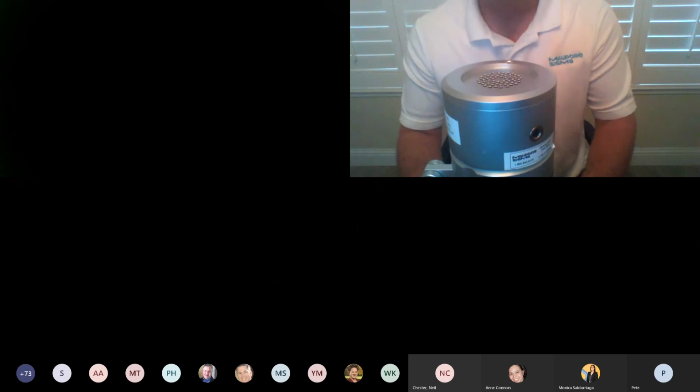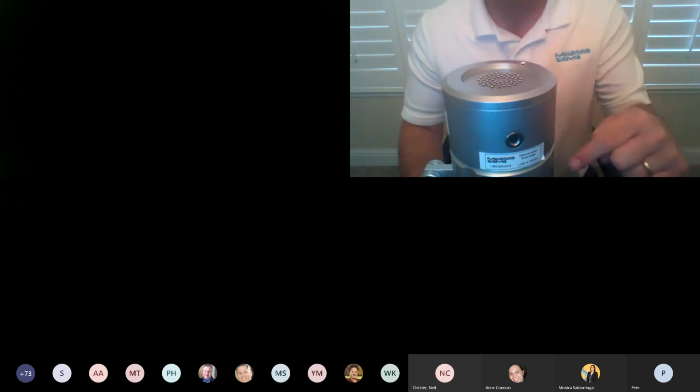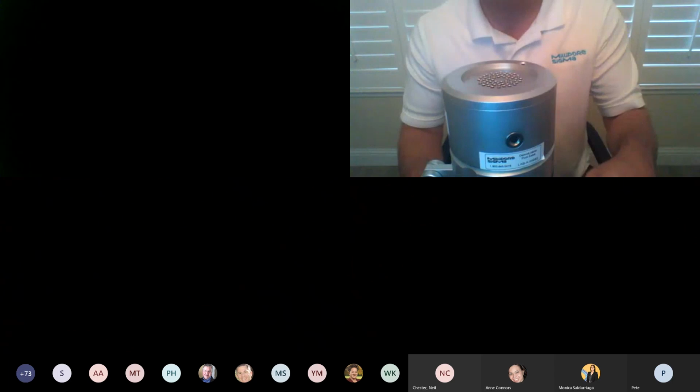Yeah, so Yasmin, there are 3 preset values of 95, 100, and 105. That's the 3 value, and that's the one I like because it calibrates it to a low, a middle, and a high, and that's what most people think of when they think of calibration. So those aren't set, but you enter the value of yours. So if I set this for 95 and it gives me values of 96, 95.3, 94.8, I average those and then input it into the MAS-100 NT.